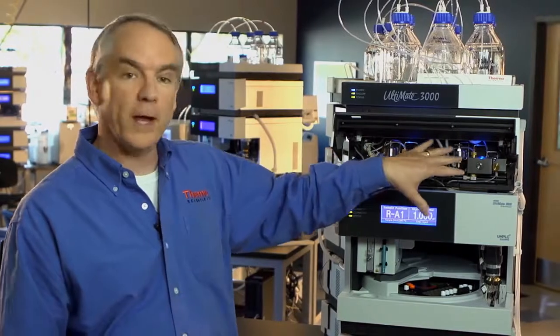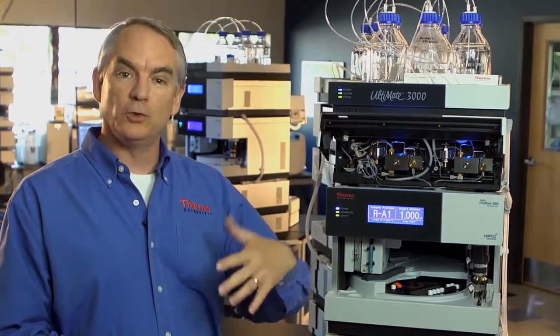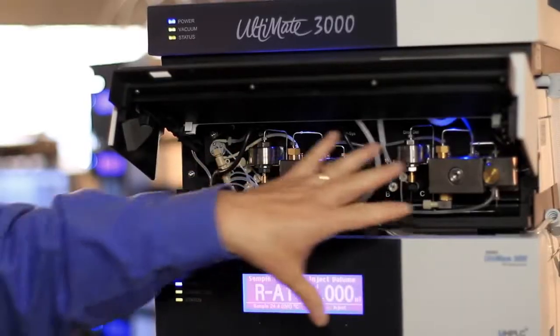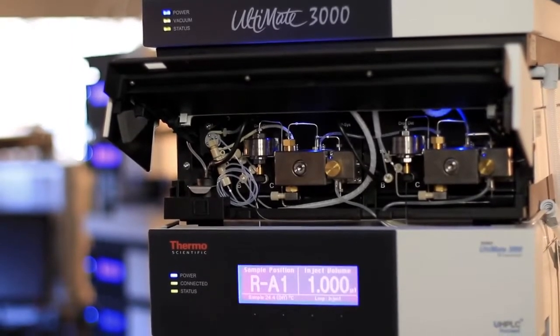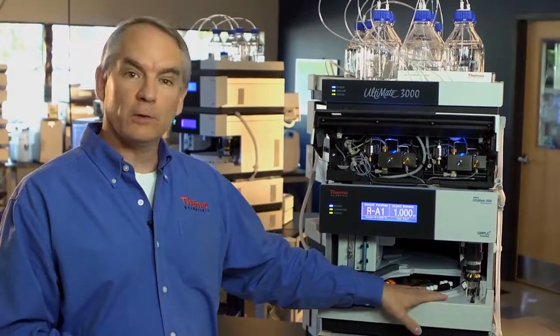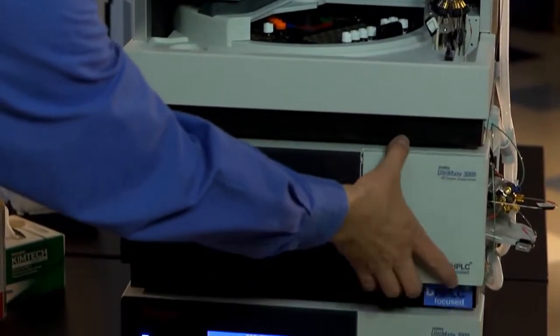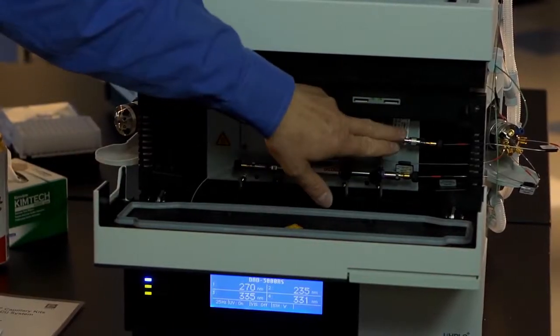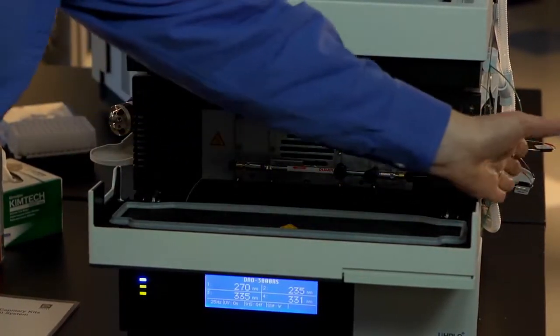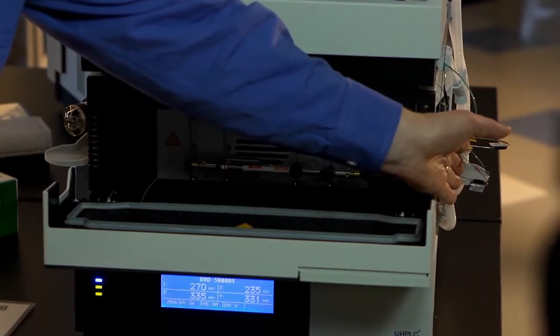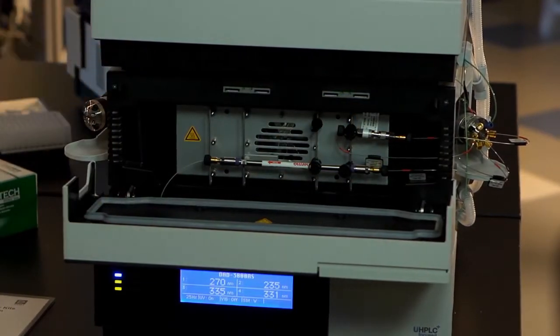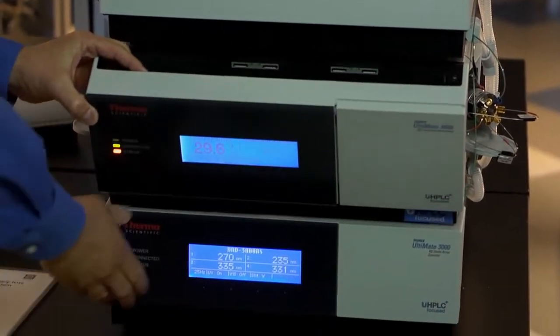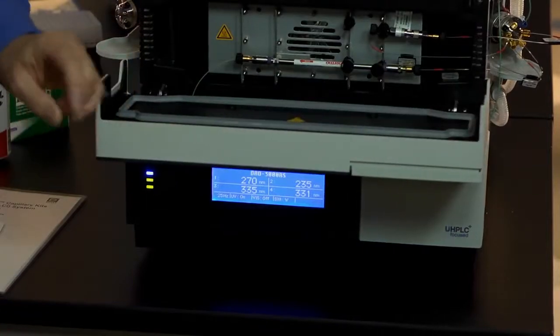Let's take a look at the components of the HPLC system that make it so easy to run online solid phase extraction. First of all we have a dual gradient pump. We're going to need two pumps, one to load the solid phase extraction column, the other to elute analytes from the analytical column and both are built in. We also have a split loop well plate sampler, a thermostated column compartment that houses the two columns, the solid phase extraction column and the analytical column and has integrated on the side a two position six port switching valve. And then finally we have a stackable detector on the bottom, in this case it's a diode array detector.